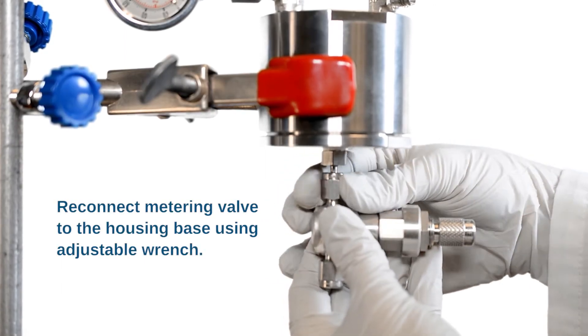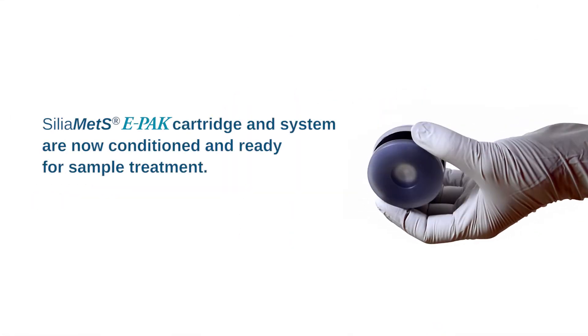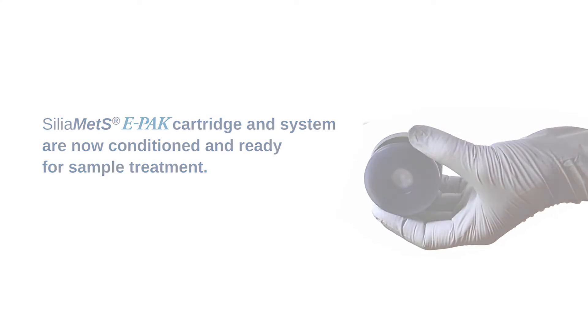Reconnect metering valve to the housing base using the adjustable wrench. Make sure that the valve is installed correctly. SiliaMet E-PAK cartridge and system are now conditioned and ready for sample treatment.